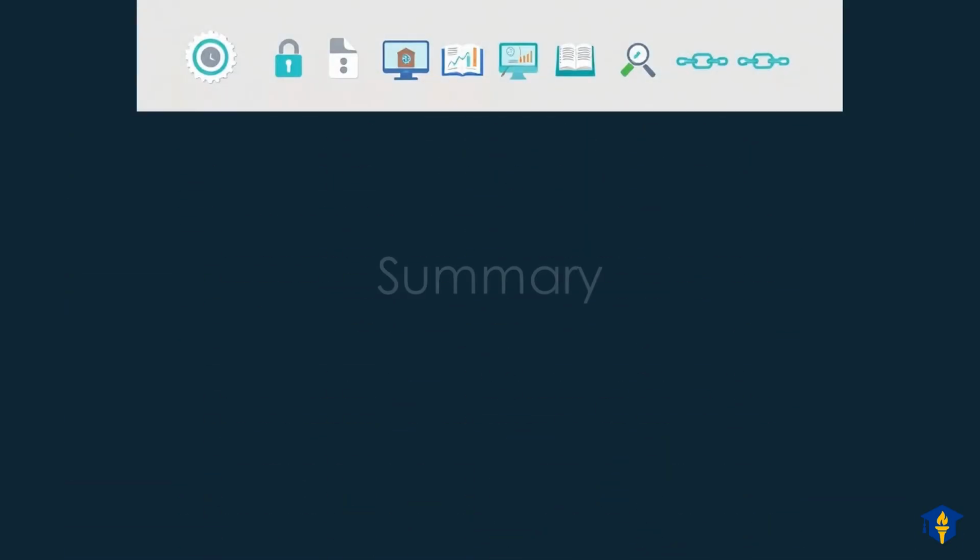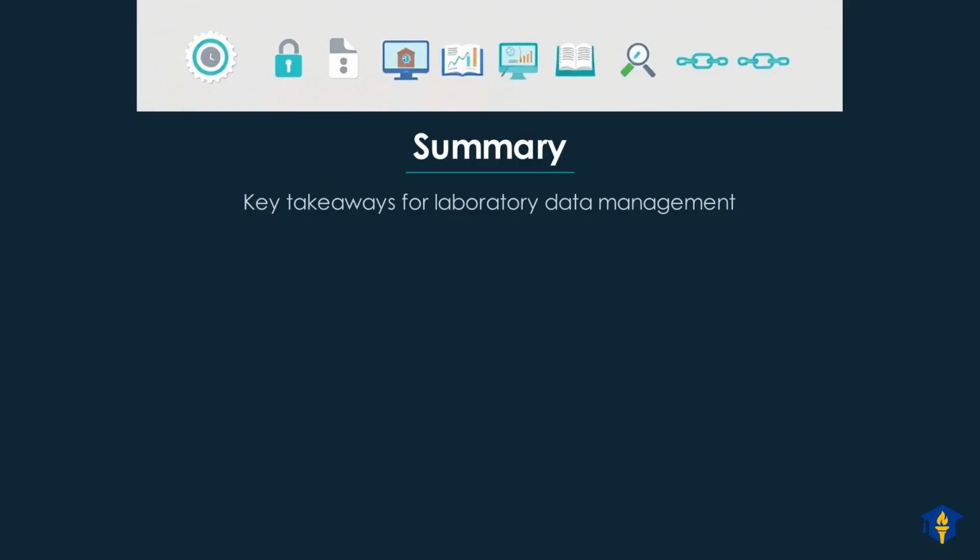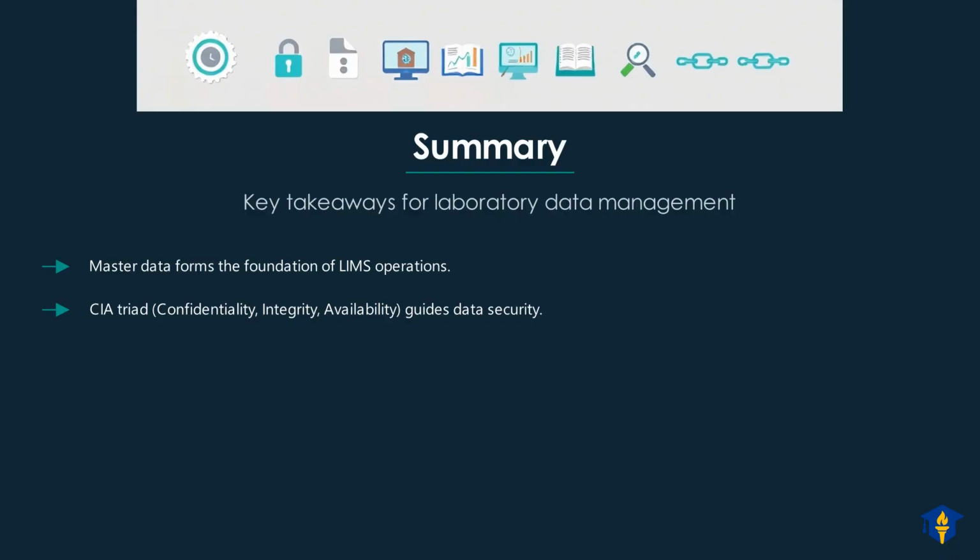To conclude, let us summarize the key takeaways for effective laboratory data management. These points highlight the most important aspects we have covered in this module. Remember, master data forms the fundamental foundation for all LIMS operations. The CIA triad of confidentiality, integrity, and availability guides data security principles.